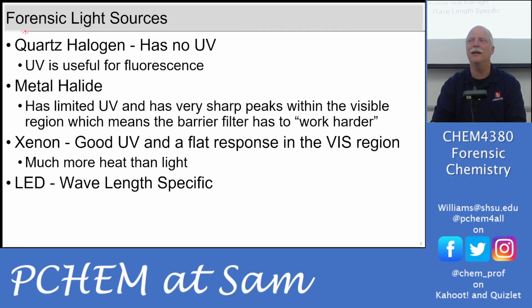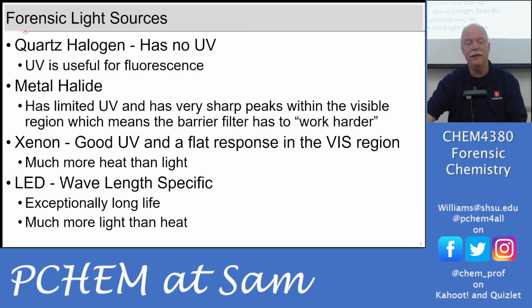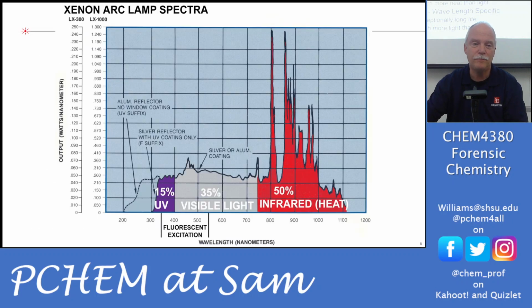It's probably a mild peroxide, but it'll destroy the organic compounds that cause the smell, and if there's bacteria too, it'll destroy that. So these are LED lights, and they're really cheap. The brighter they are and the more LEDs you have, the more expensive. But still, compared to these xenon crime lights, they're much cheaper. They have exceptionally long life, and they give you more light than heat, so that's very nice.